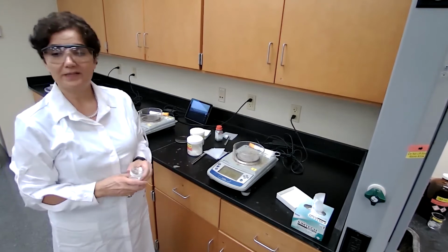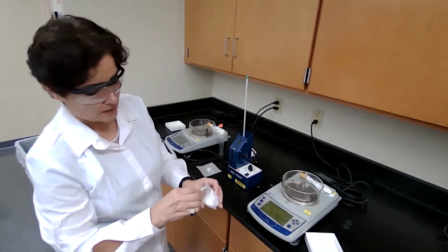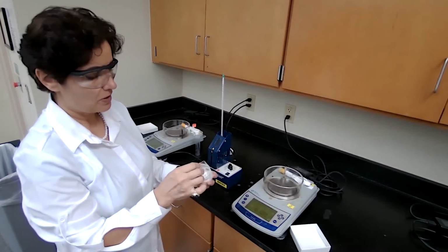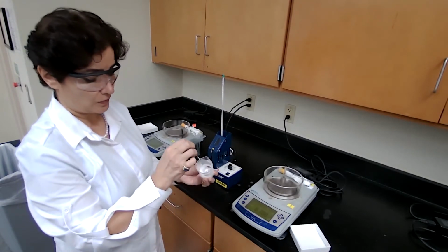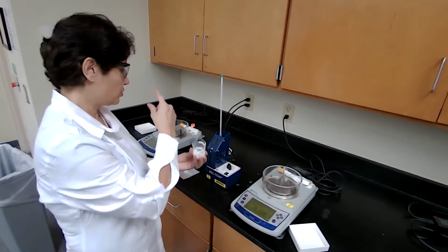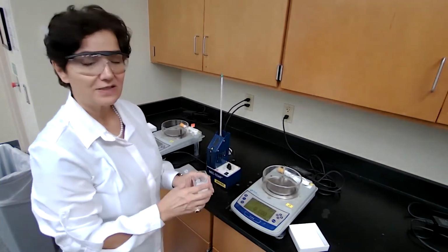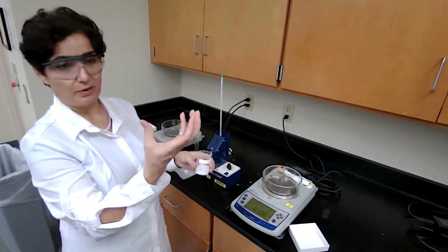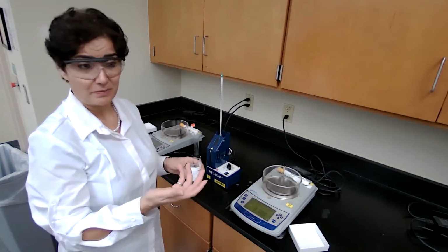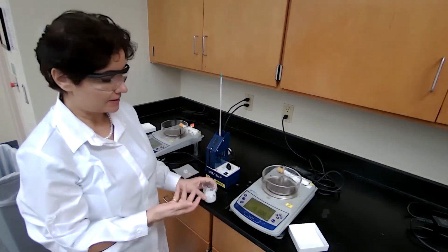Okay, get ready for the melting point. This sample must be dry. If the sample is not dry, it would be hard for it to get into the capillary tube, or it can get into the capillary tube, but you won't be able to transfer it down when you're dropping it through the hollow glass tube. So if it's not dry, what would you do? You're going to prepare a hot water bath at 60 degrees, which is a higher temperature than the boiling point of ether. We place it in the hot water bath until it's completely dry.